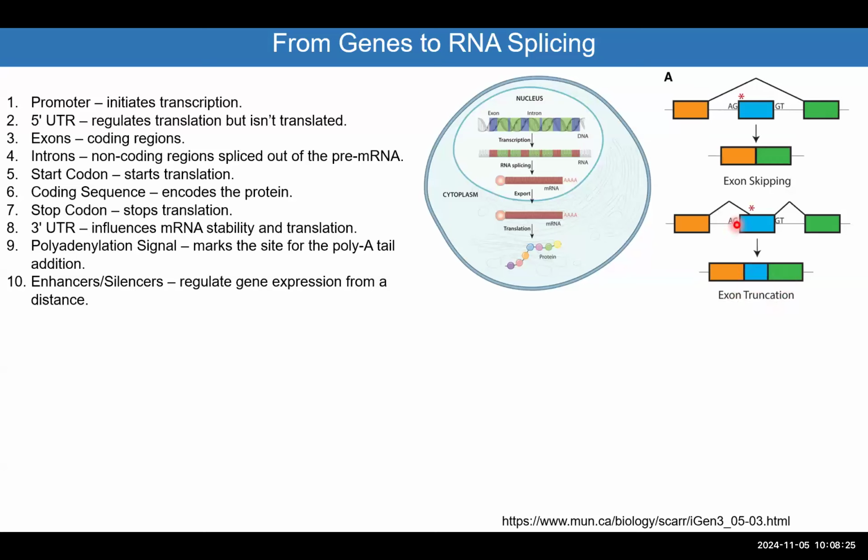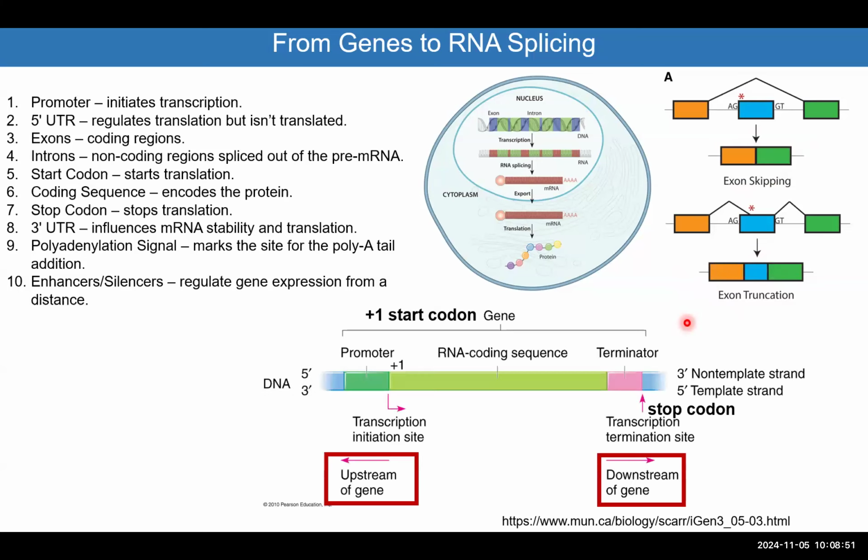So in practice, the genomic DNA is the same. However, the messenger RNA from these two are different. And today we will discuss how we can identify this isoform from that isoform by qPCR. Okay? So this is very important to take into consideration.